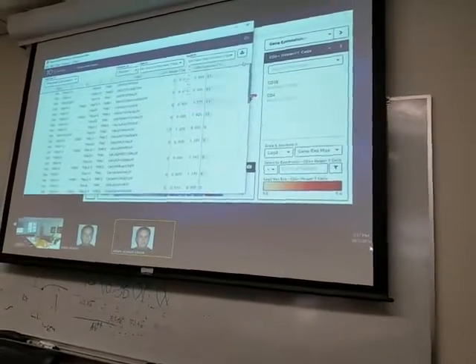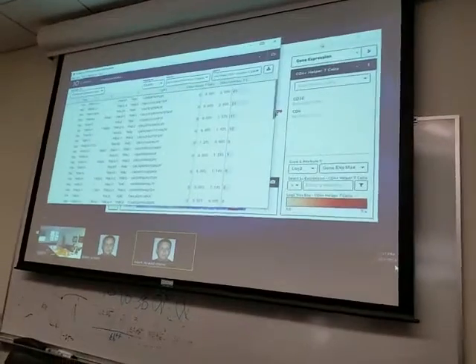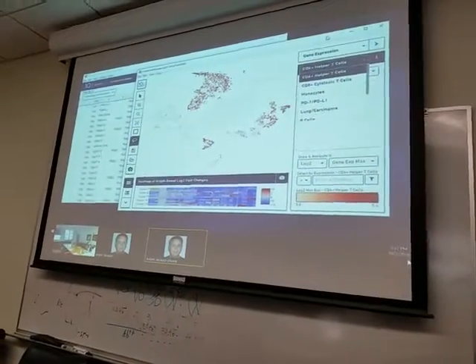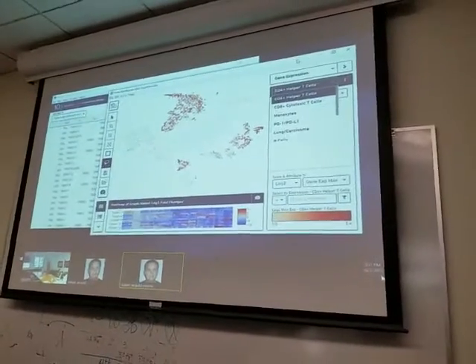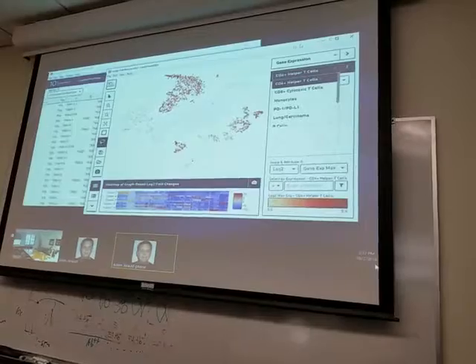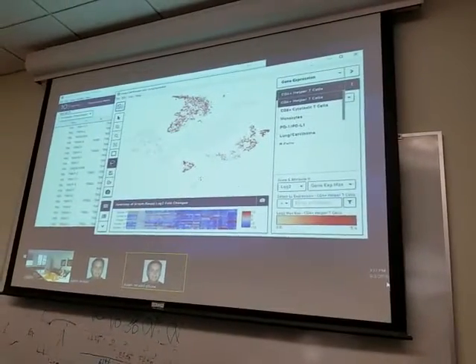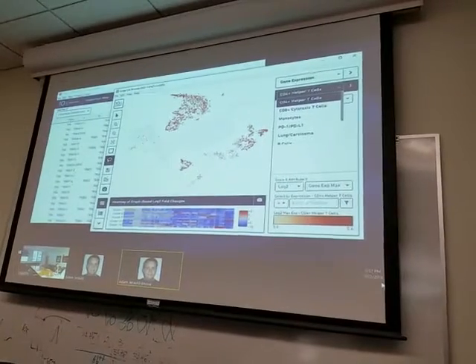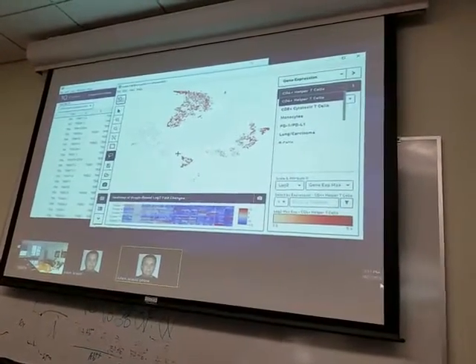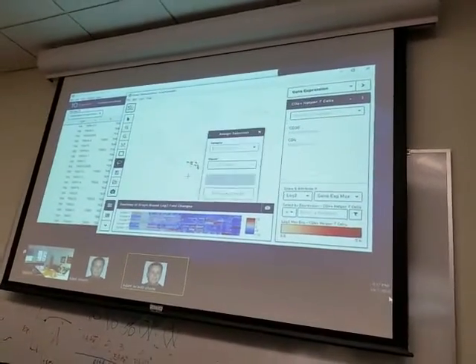So for example, that one population down there, the little triangular one in the bottom, can you then save those and export, I don't know, the T cell receptor, because we can get the genes in there, but can you look at the T cell receptor list for that little bottom population? The little triangle, that one. Or any little, no, the one above it, I guess.